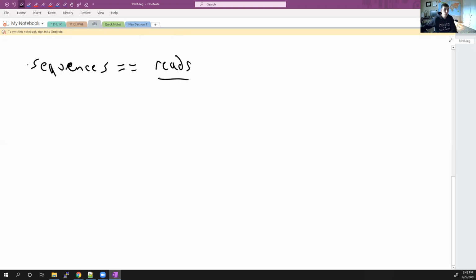So doing this prep, I can't do, right? I'm not very good in the lab. And so prepping RNA or DNA for Illumina sequencing, I can't do. I can just process the output.